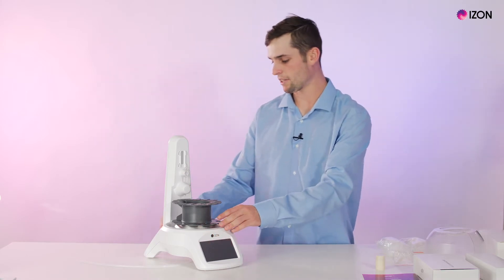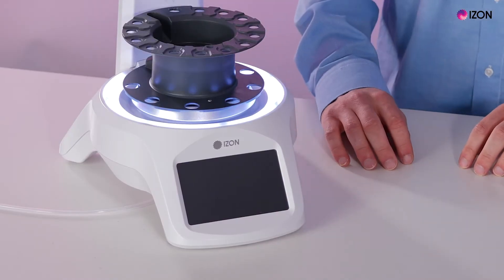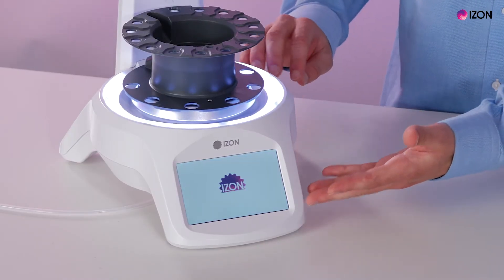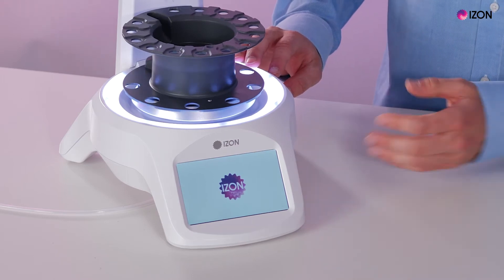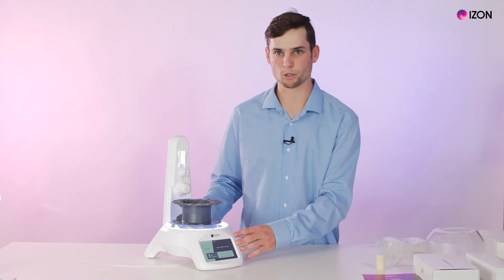Connect the AFC to power and turn it on. The AFC will then turn on showing the initializing screen, rotate to go back to zero position, and now we have the home screen menu.